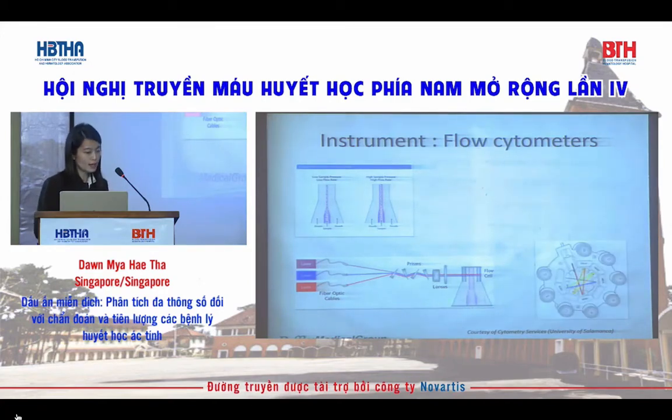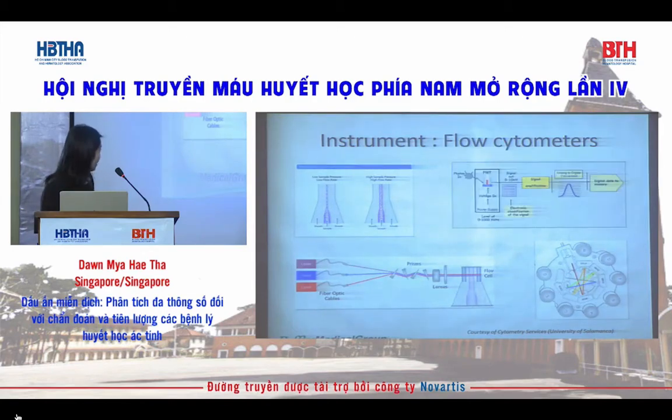And the second thing that can happen is that if the cells have attached fluorochromes on the surface or inside the cells, these fluorochromes will be excited by the laser light, and light energy again will be emitted from these fluorochromes, which will be captured by the relevant optics of the instrument, which again is amplified in the photomultiplier tubes, and finally this signal will be converted into electronic data, which we will see and analyze later on.